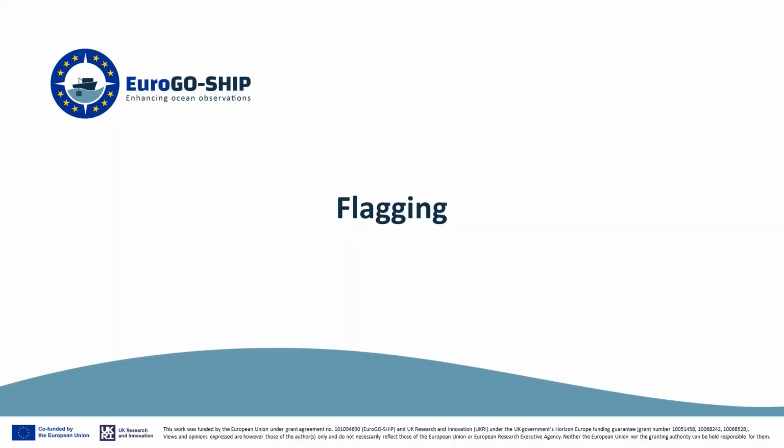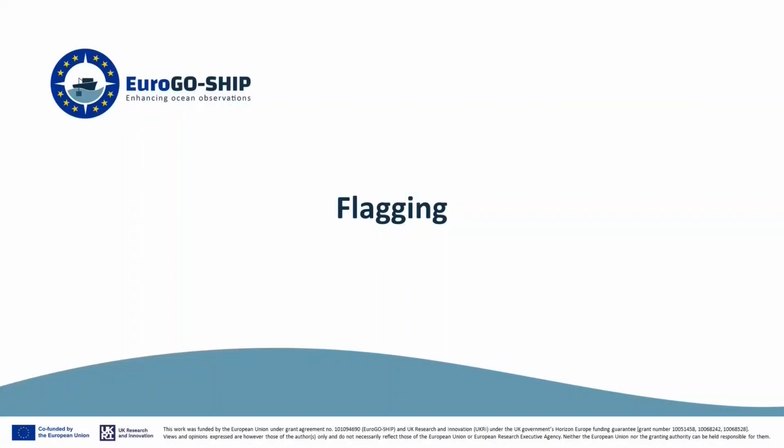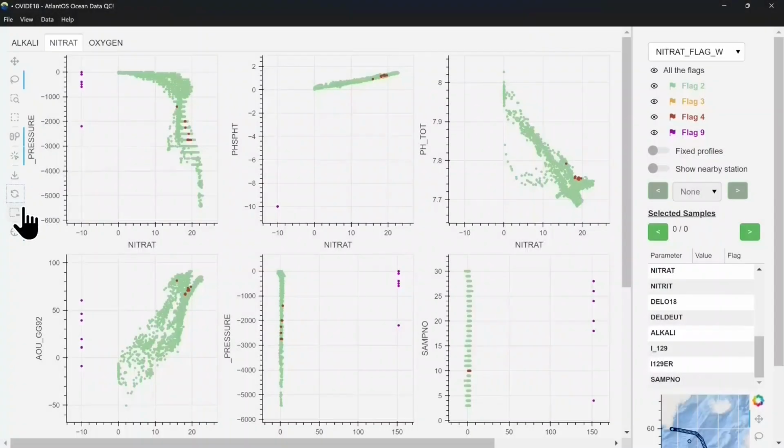Let's see the flagging process. The quality control task consists of assigning quality flags to the data, where we consider the values are good, questionable, or bad, following the WOCE standards.